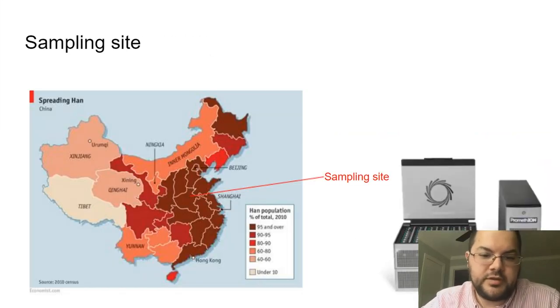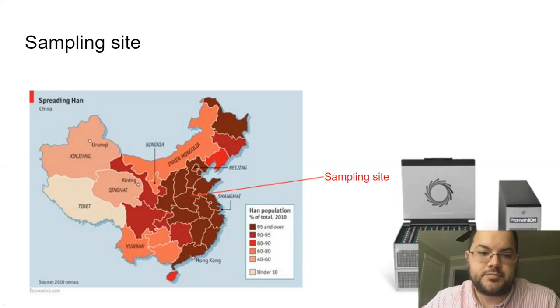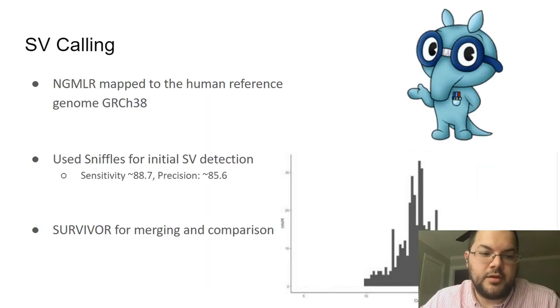The way we did this was by taking a cohort that was really central in the Han Chinese population. In fact, we required that all the samples we are sequencing have been for 3 generations or longer in this district of China. And we used the Oxford Nanopore PromethION system to sequence these samples. So basically, we run one flow cell per sample. And then on the tool side, we use different tools that my group and I developed, which I just want to go through very briefly.